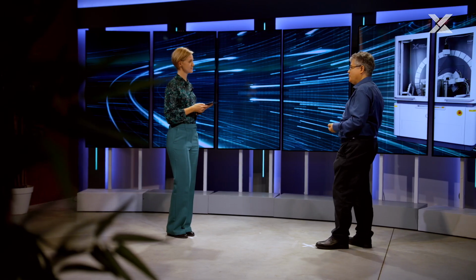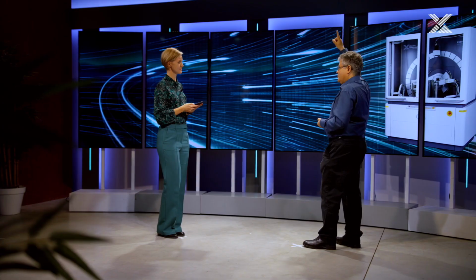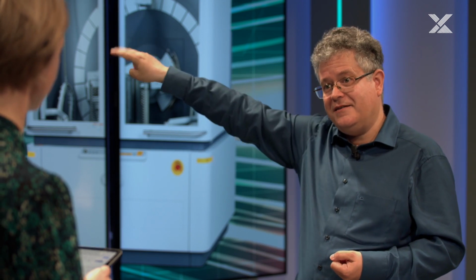If you go to the other side, where you have those humps, you also have information, and that is information about the local structure. And it has turned out that you can probe that part best when you use very hard radiation, like molybdenum or silver, if you have a laboratory source, of course, and you collect as far out in angle range as possible. And then the high angle part here, which is seemingly featureless, actually contains the fingerprint of the molecules.